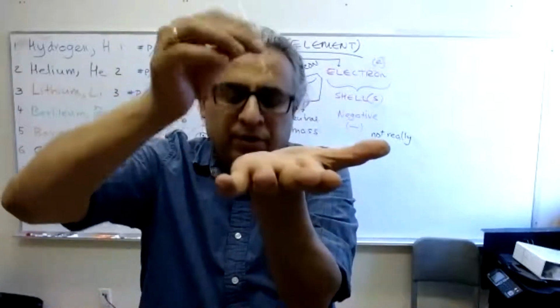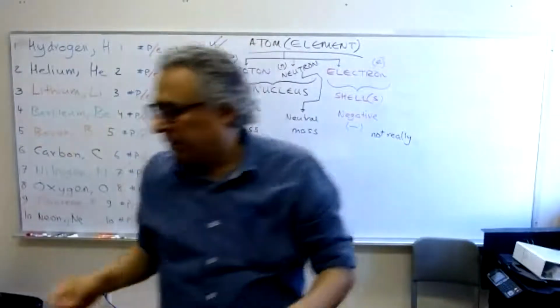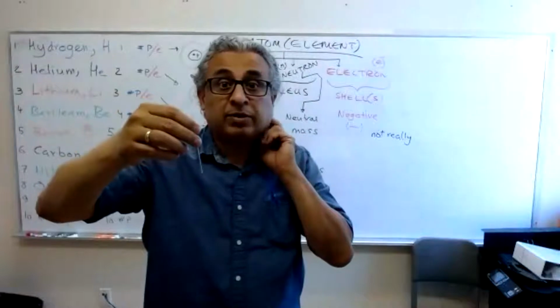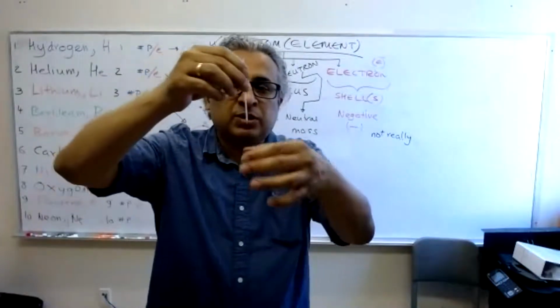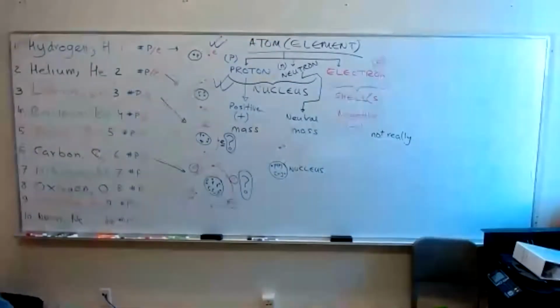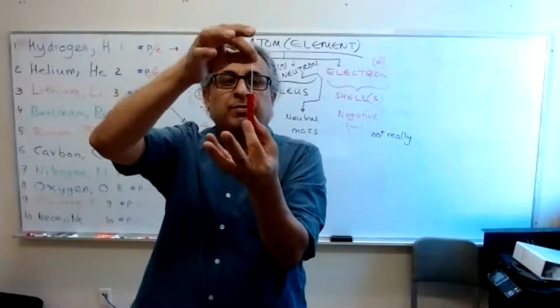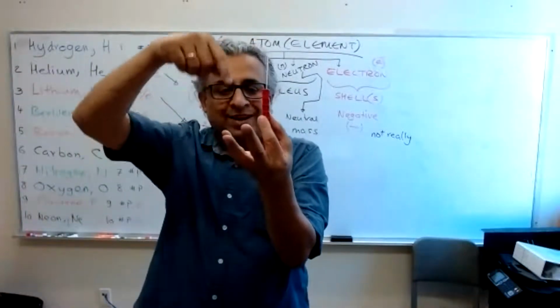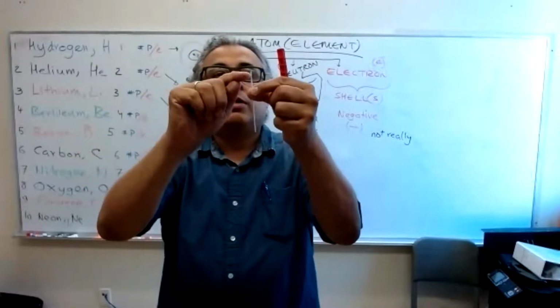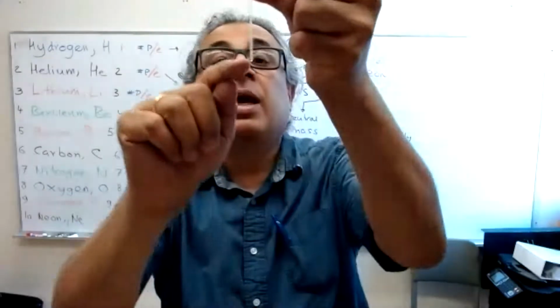Then you have to tap it on a hard surface. Sometimes you can run it through a little straw. Sometimes I bring straws from McDonald's or Starbucks for my students. Imagine this is an empty straw and there's a hard surface at the bottom. If you drop the tube from the top and it hits the ground really hard, that brute force pushes the compound from the top into the bottom. So your compound must be at the closed end.